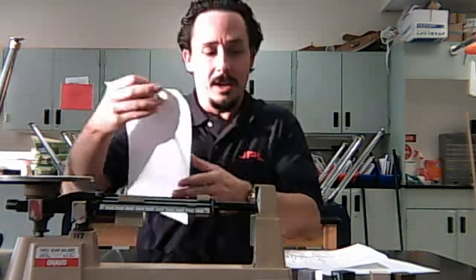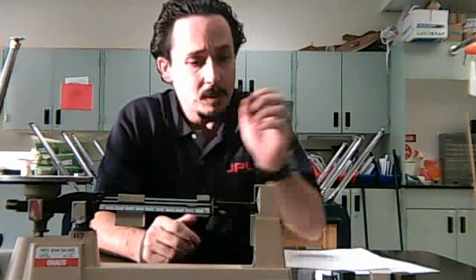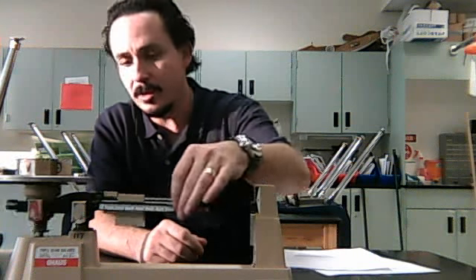Once you're done with that, and everything is perfect, you're going to turn it in to the substitute teacher. It is due at the end of the period. Please do not take it with you. It's worth 20 points in this week's portfolio. And when you go, I need you to make sure that the 4 items that you have are back on the balance with weights pushed to 0.